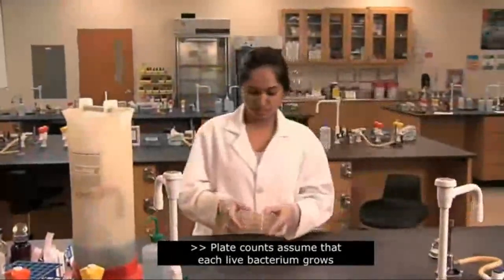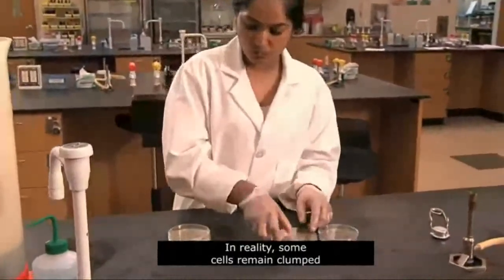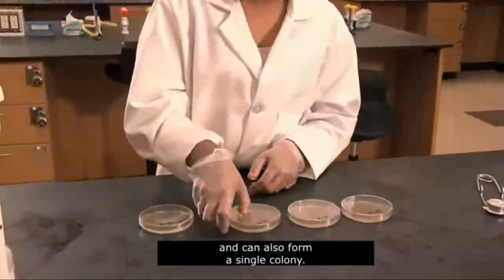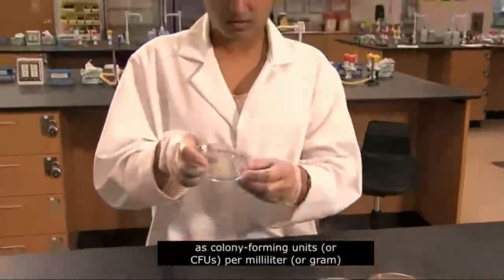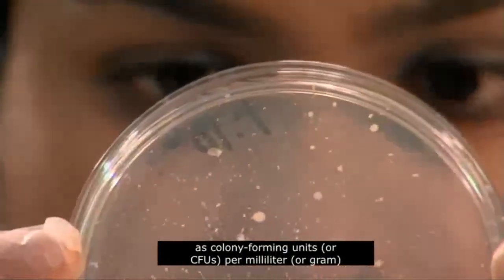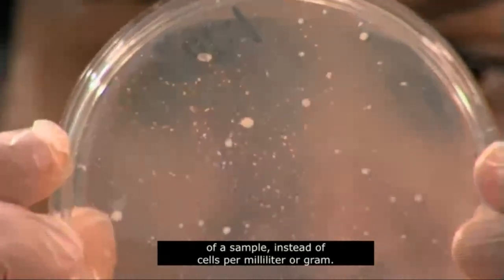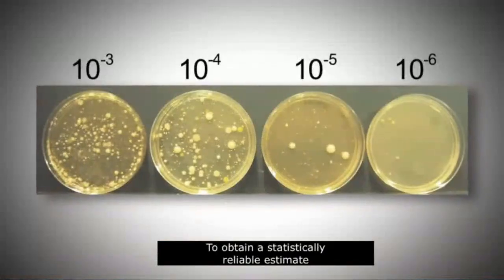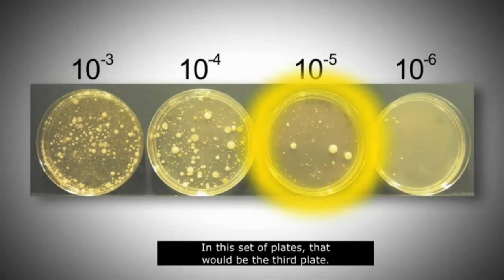Plate counts assume that each live bacterium grows to produce a single colony. In reality, some cells remain clumped and can also form a single colony. Therefore, results are reported as colony-forming units, or CFUs, per milliliter or gram of a sample, instead of cells per milliliter or gram. To obtain a statistically reliable estimate of the quantity of bacteria in your sample, select the plate that contains between 30 and 300 colonies. In this set of plates, that would be the third plate.